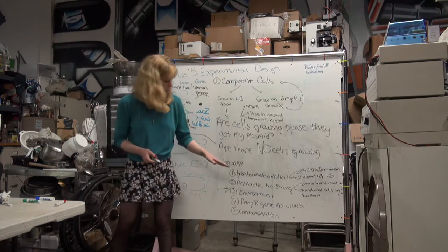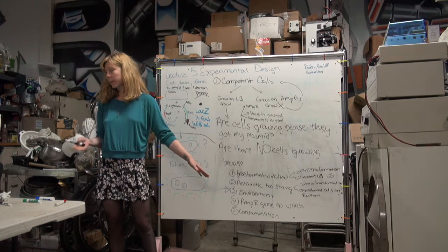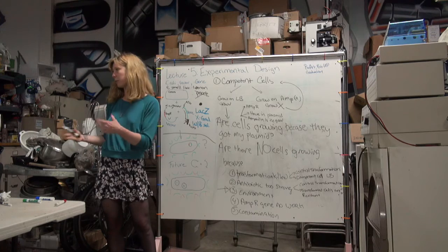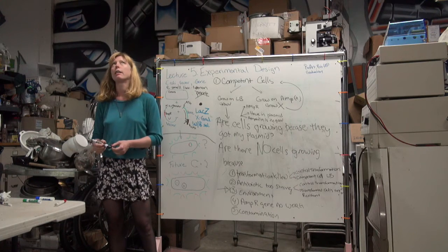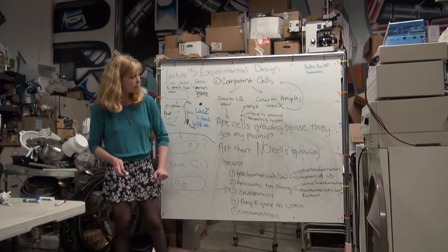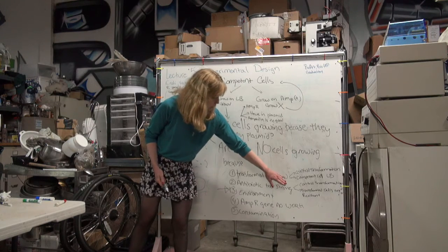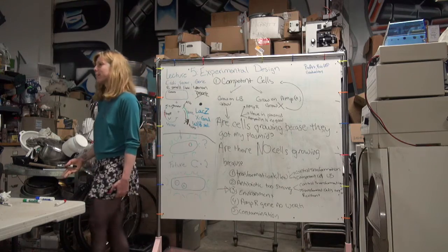If all your other controls are working, right? So the ampicillin resistance gene from that similar plasmid, or that same gene is working in the plasmid, you're going to assume it's working, especially if the ampicillin's at the right level, because your control transformation and your pre-transformed cells are growing, right?